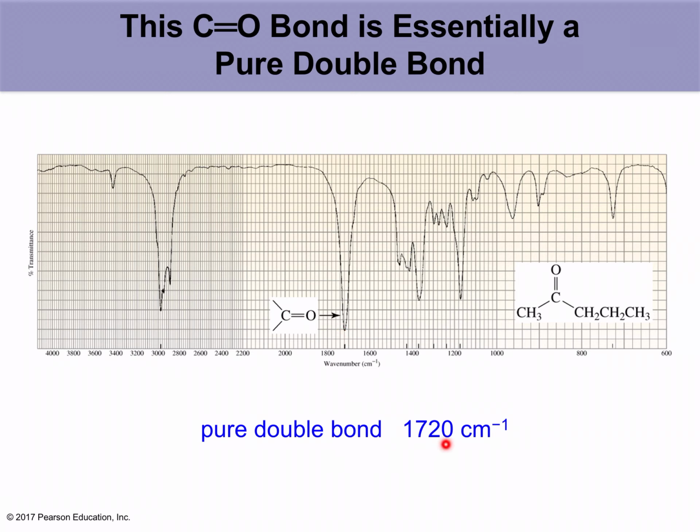If you have a ketone made from an experiment, you need to know whether you have made it. Let's say you do an oxidation of an alcohol group, let's say with chromic acid, and it becomes a carbonyl group, a ketone. You want to know if your reaction has gone to completion or the functional group that you want has been made. You run IR, and you see there is a peak around 1720, and you're going to be so happy seeing that: yay, I made my carbonyl group.